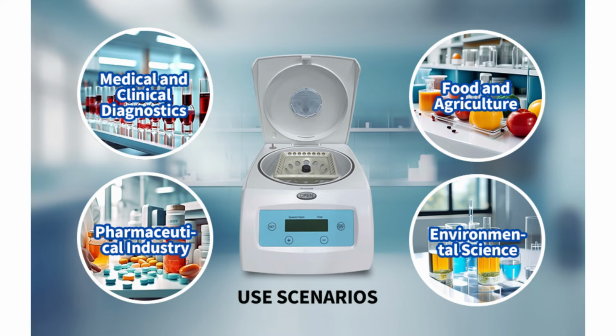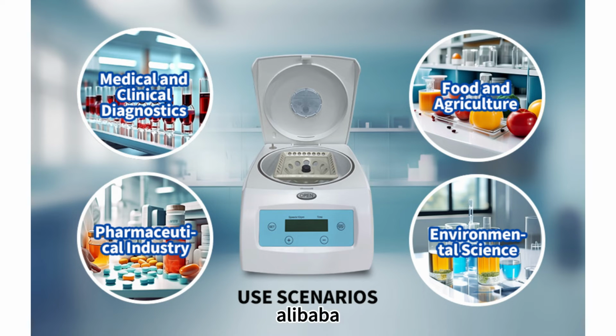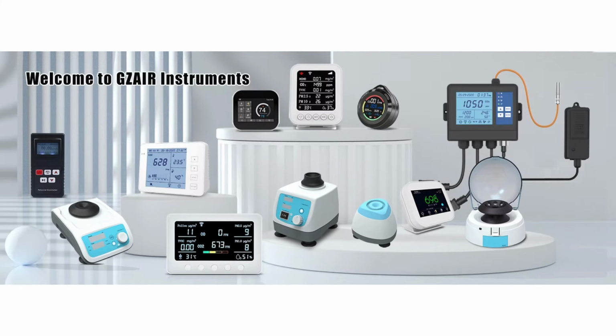Multi-tube rotor. Description: designed to accommodate multiple small tubes or microplates. Suitability: perfect for high-throughput applications and microsample processing. Specialized rotor. Description: custom designed for specific applications such as PCR tubes or blood collection tubes. Selecting the appropriate rotor type is crucial for effective sample processing.